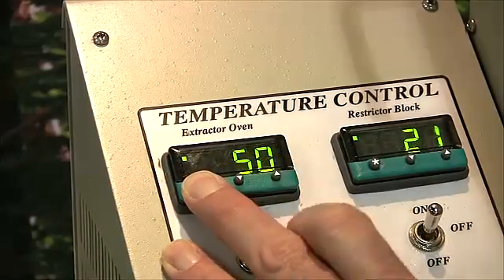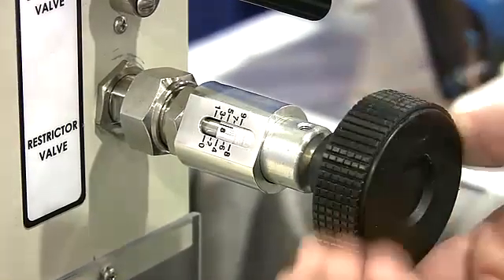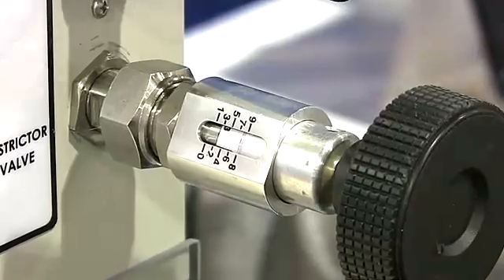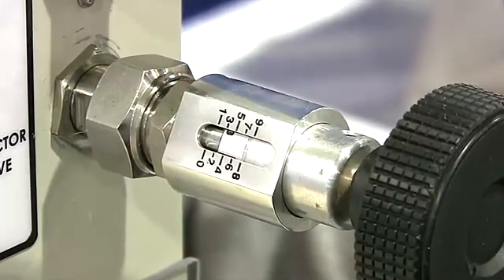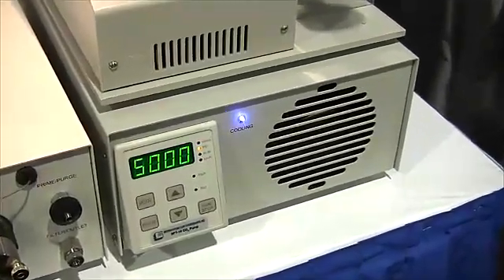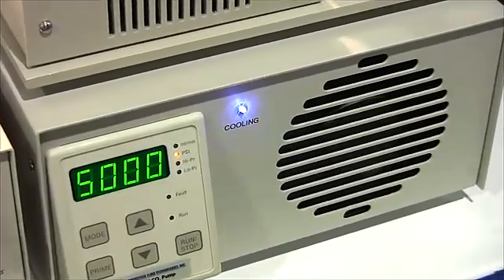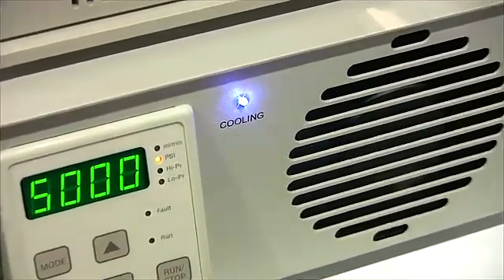A robust variable restrictor enables the user to achieve very precise control of flow rates. The thermoelectrically cooled CO2 pump eliminates the need for an external chilling module, and an optional co-solvent addition module facilitates extraction of moderately polar compounds.